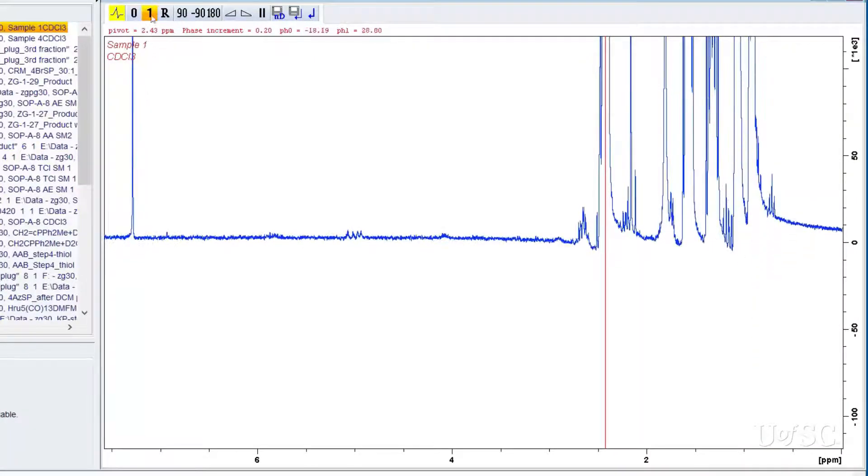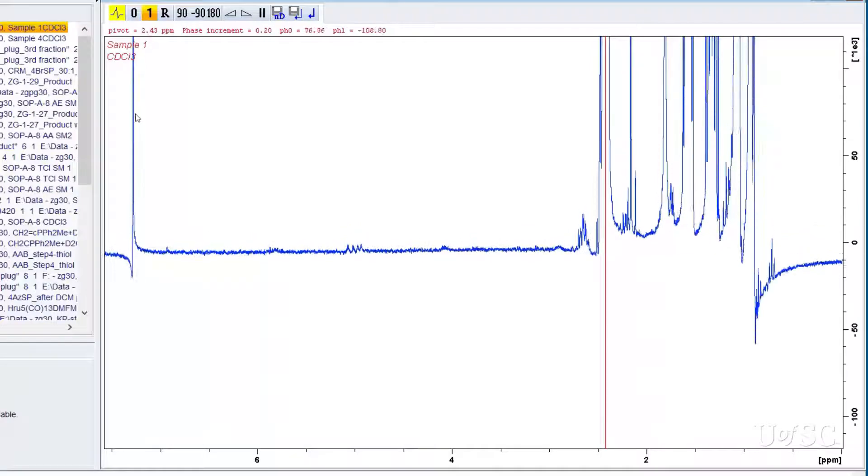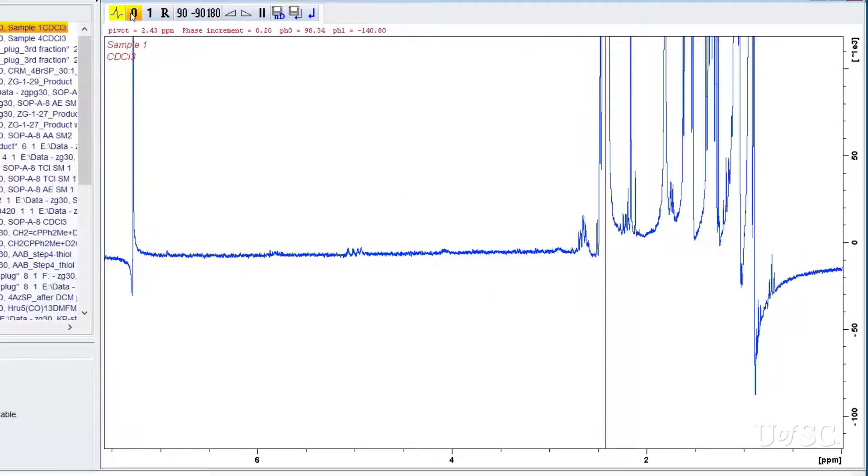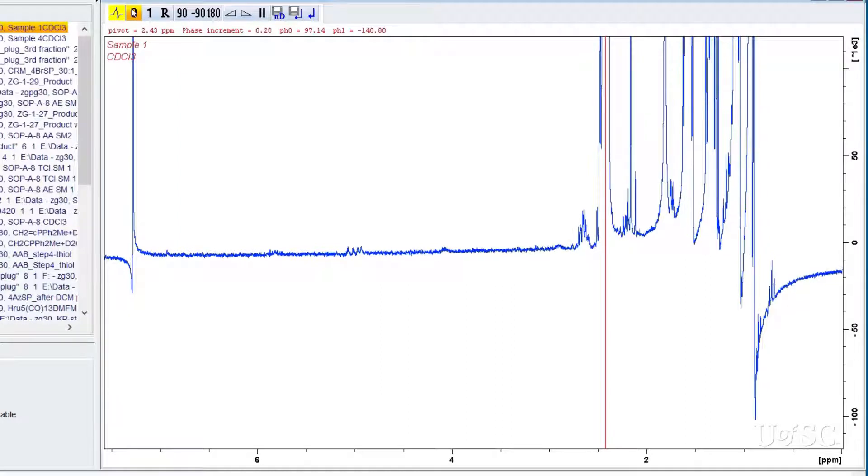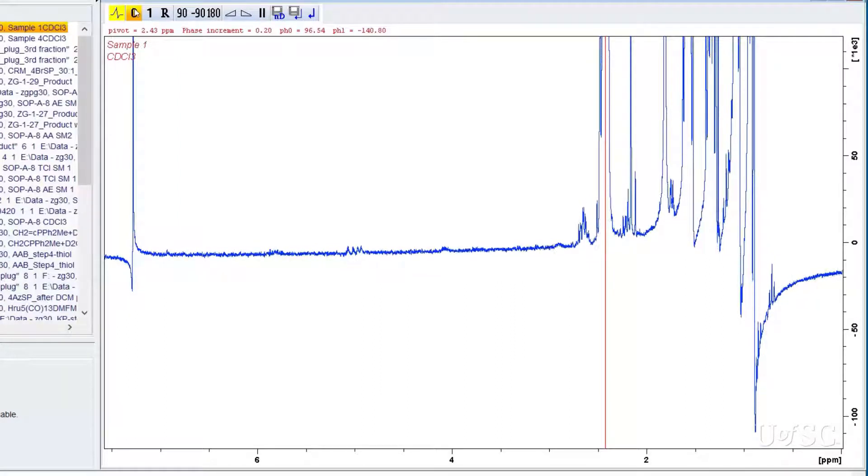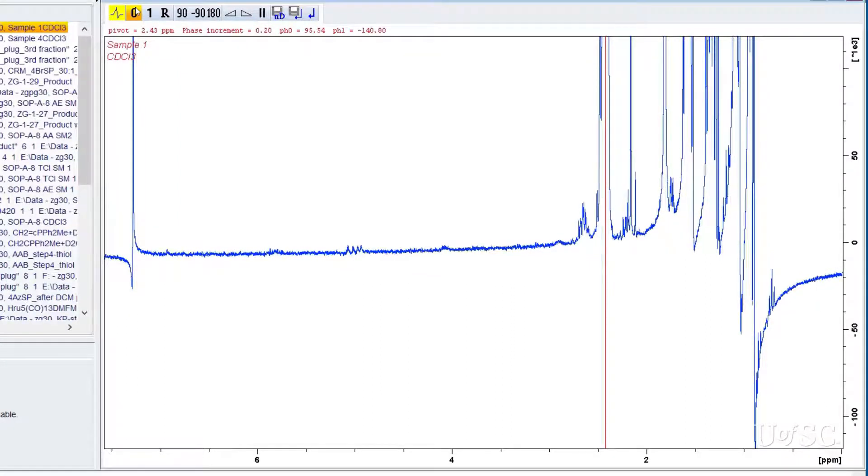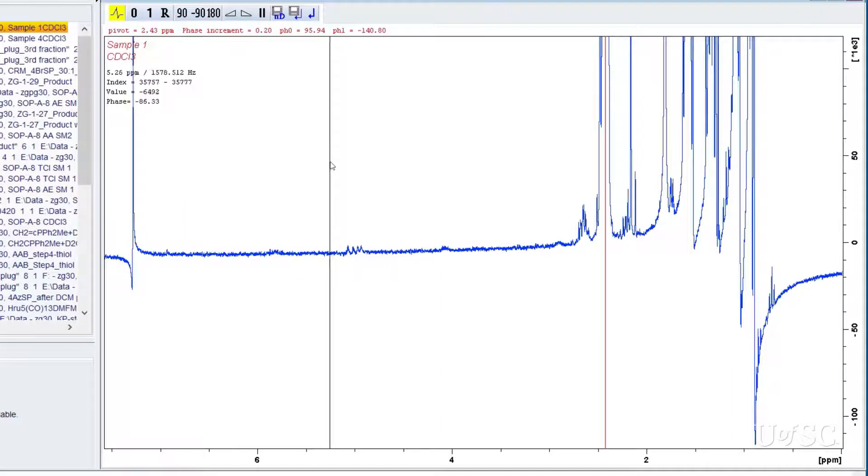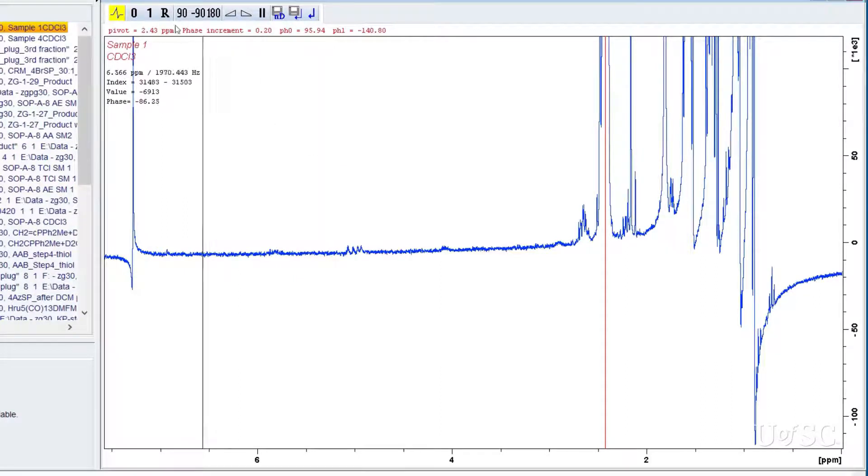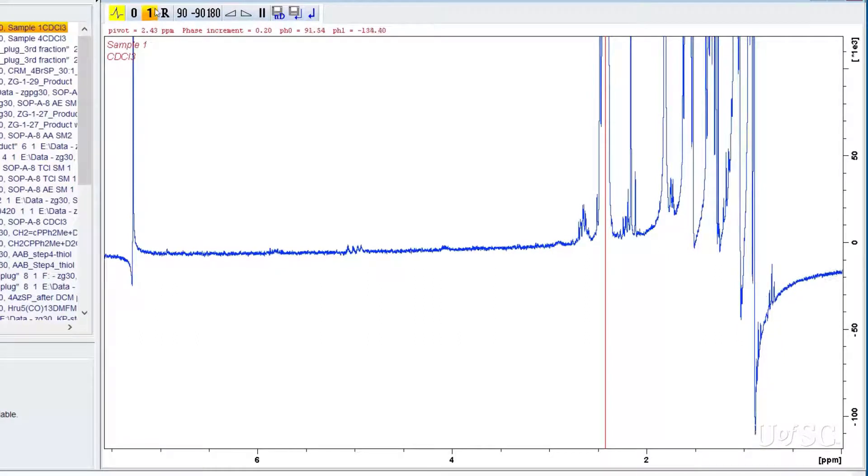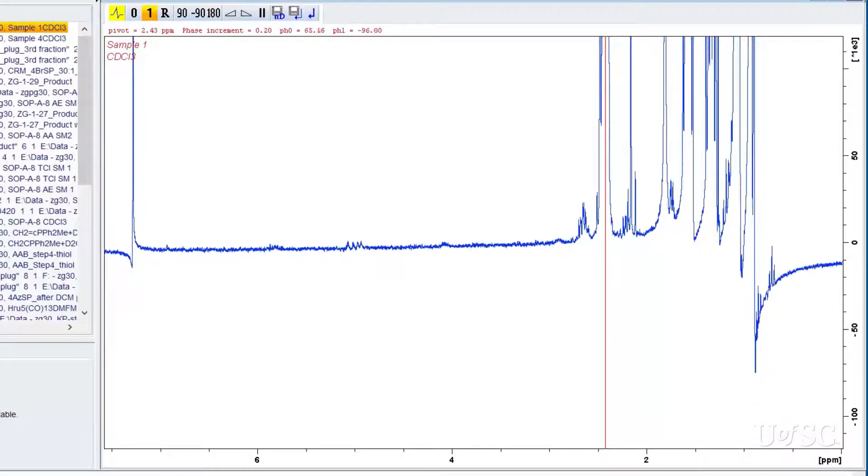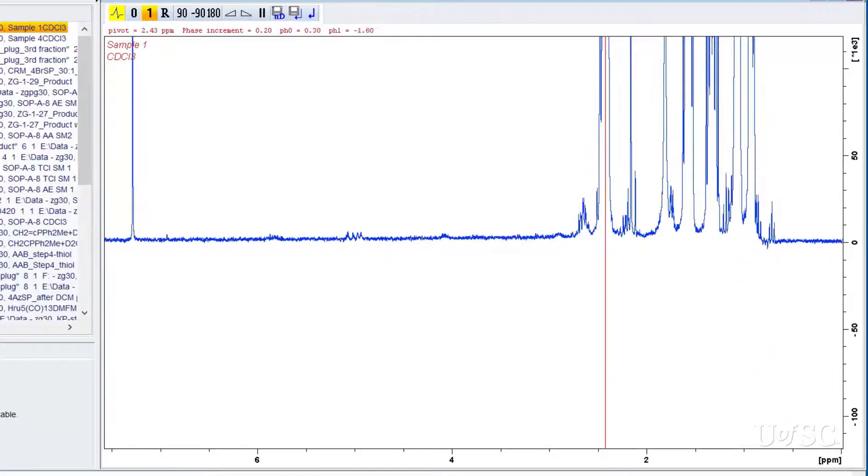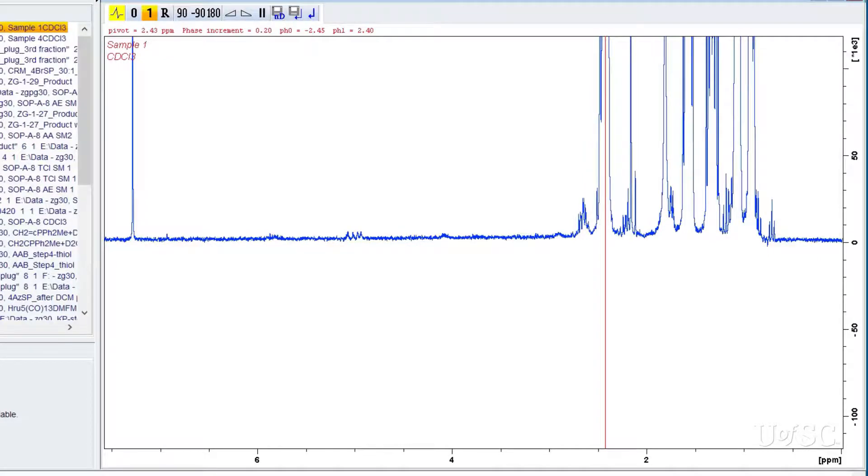To correct the spectrum you would first adjust the zeroth order phase. Focus your attention on the peak under the pivot point. Adjust the phase until the baseline going into and out of the peak is flat and even. This might be difficult for crowded regions and changing the pivot point to a less crowded region might be helpful. Next, make adjustment to the first order phase. Here you should focus your attention on a peak far away from the pivot point. Remember that adjusting the sensitivity will help you find the correct phase.